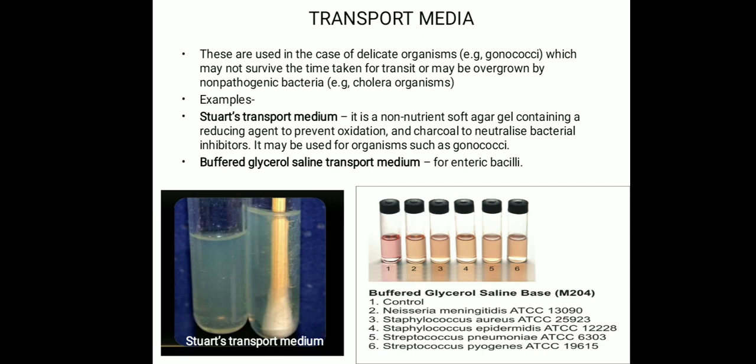So for that purpose we will need transport media, and if we want to transport specimens from one hospital to another, or from one clinic to another, where we don't have the required materials or reagents for detecting the bacteria.